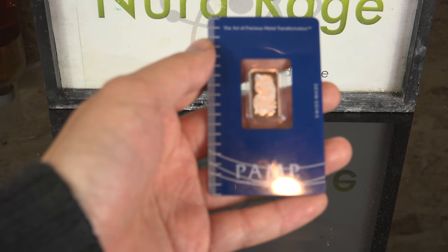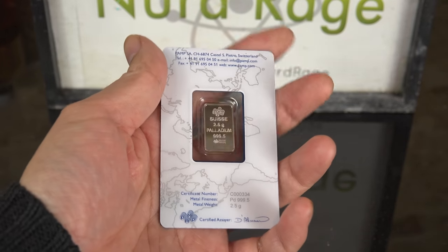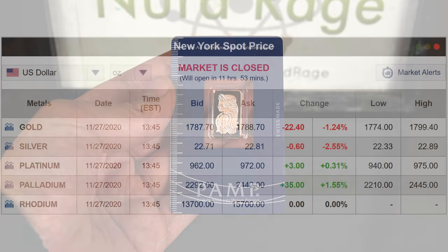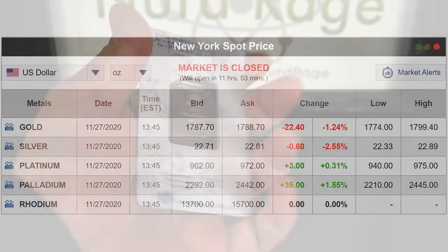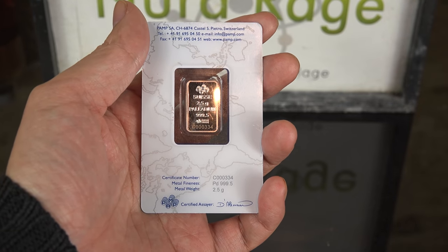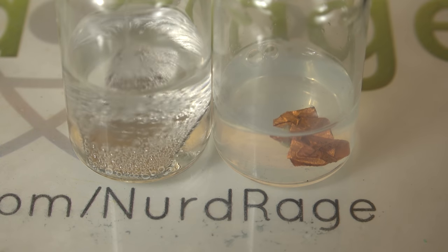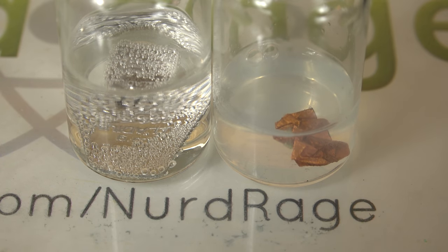Greetings fellow nerds. One of my viewers donated this 2.5 gram bar of palladium metal. This is an extremely generous gift, as the spot price of palladium today is even higher than that of gold. I never would have bought this myself, but thanks to this donation we can do some palladium chemistry. In this video I'm going to test its chemical resistance against a few common known corrosive substances and see how we can efficiently convert palladium metal into a metal compound.